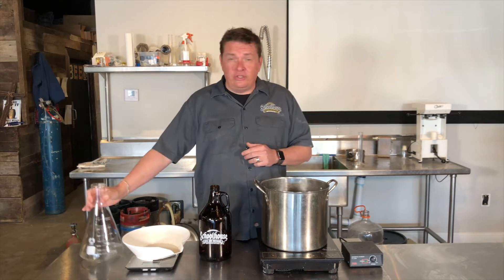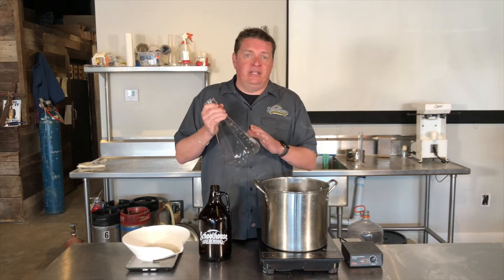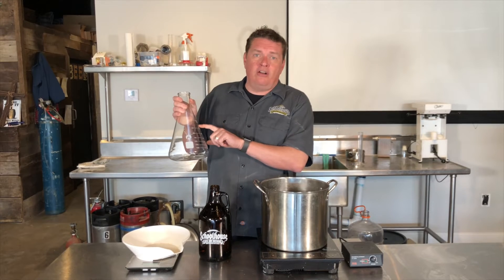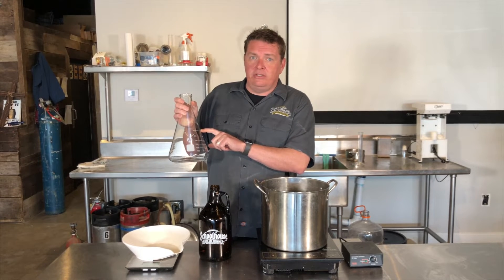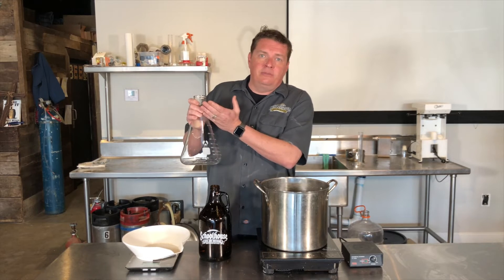Step one to our yeast starter is to bring the water to a boil. Usually what I do is I take my Erlenmeyer flask, throw it on a burner at the house, and bring it to a boil. I take 2,000 milliliters — we're going to boil off probably 250 milliliters at that time, but once we add the DME, it actually goes back up.